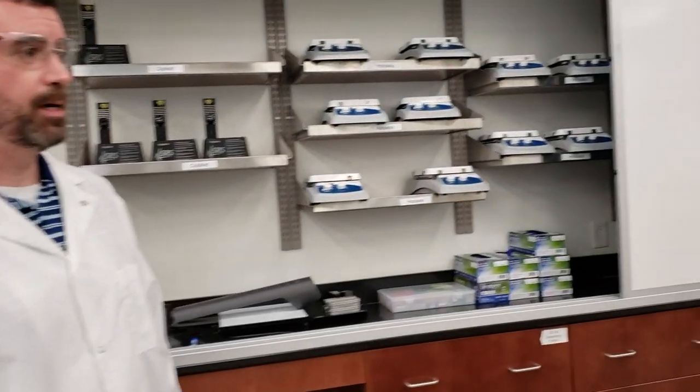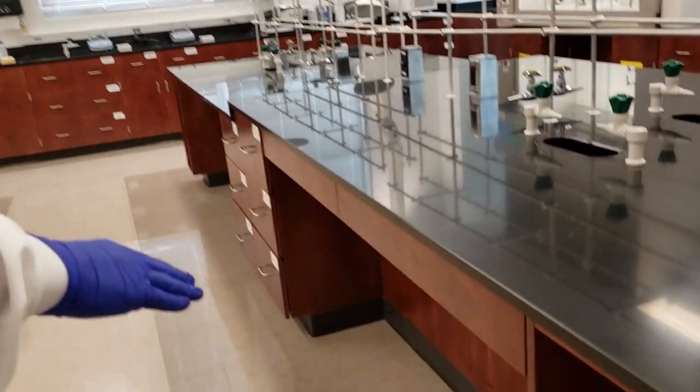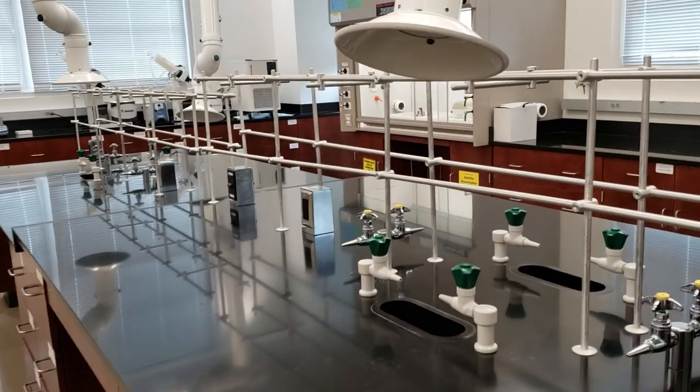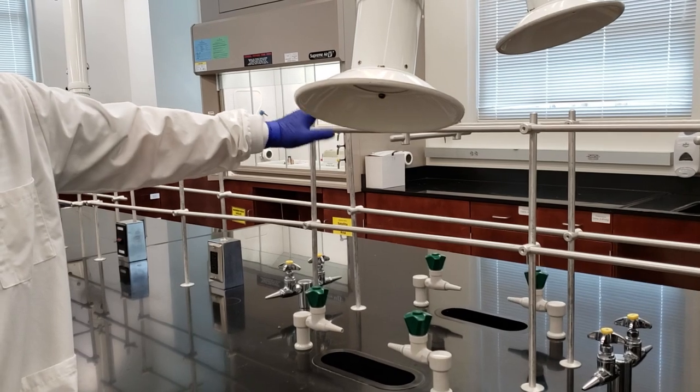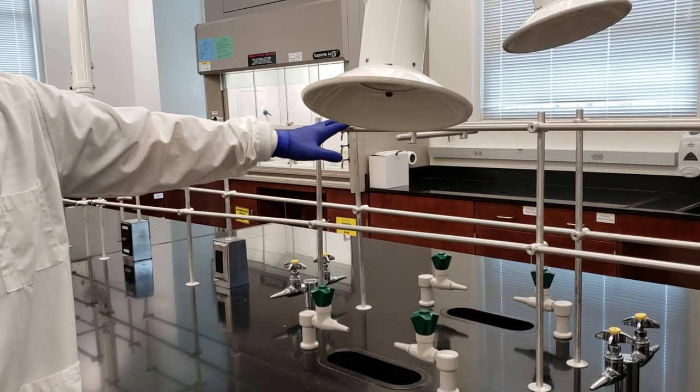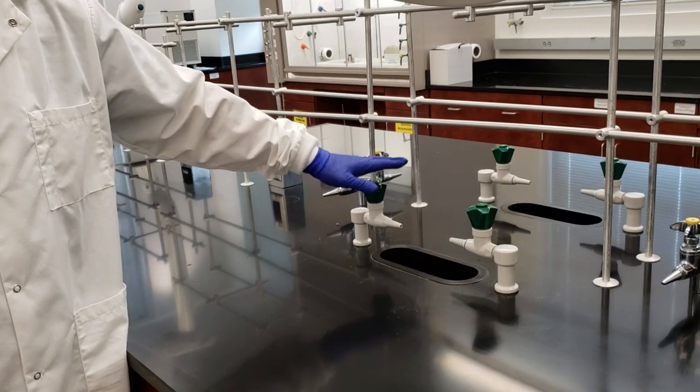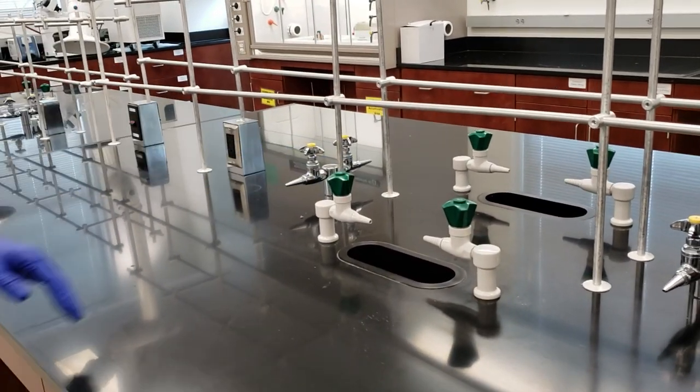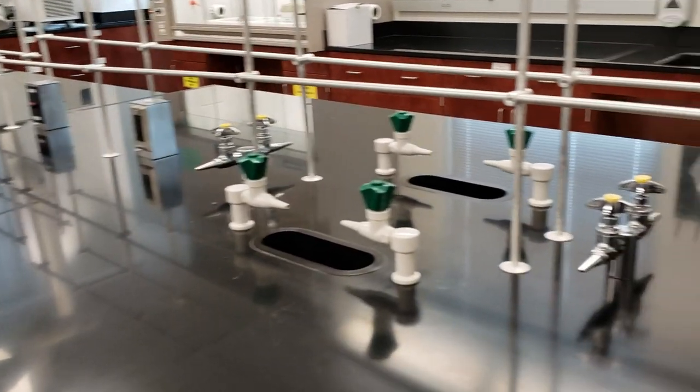Let's take a look at the general layout. We've got three bench tops, each handling four groups of two students. We have monkey bars which double as ring stands where we can attach clamps and glassware. We've got cup sinks and faucets for our condensers, feeding them with cool water for reflux and distillation. All electrical outlets and internet connections are here.